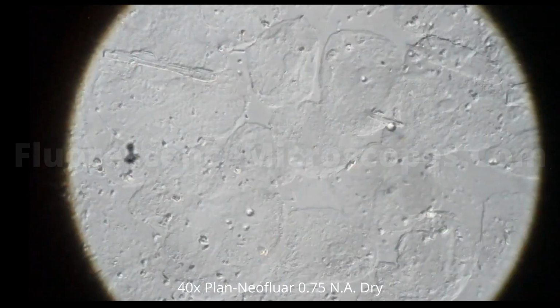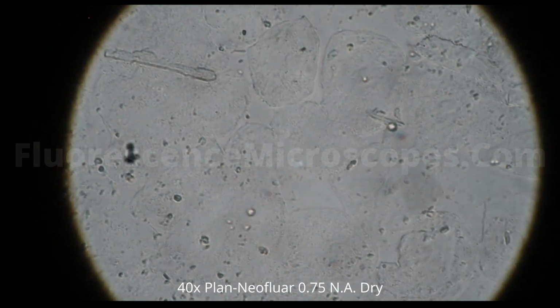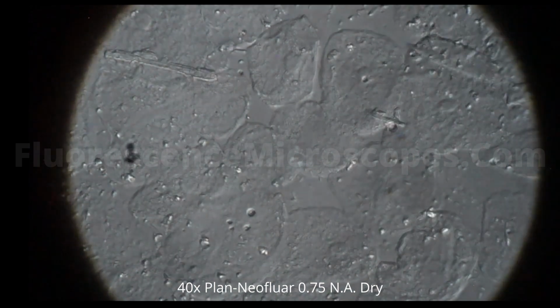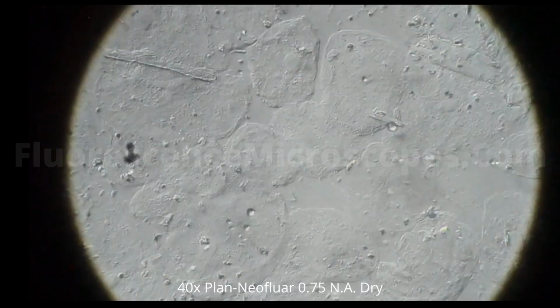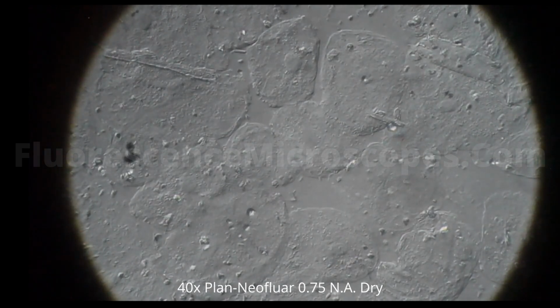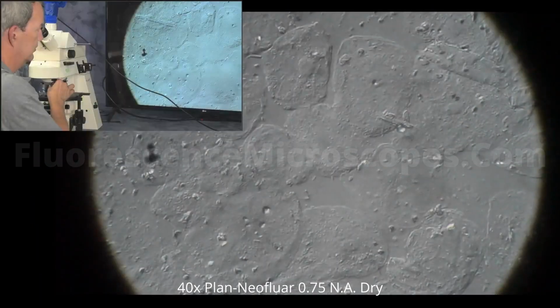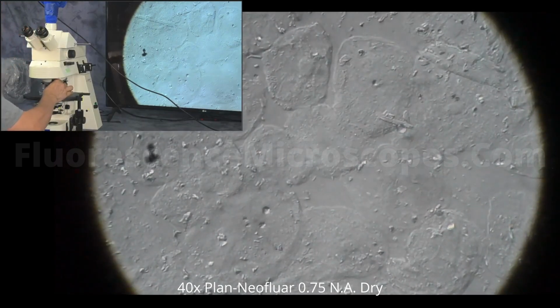Let's adjust the DIC. I'm getting my three-dimensional image at this point. Then after this, we'll try some oil immersion.